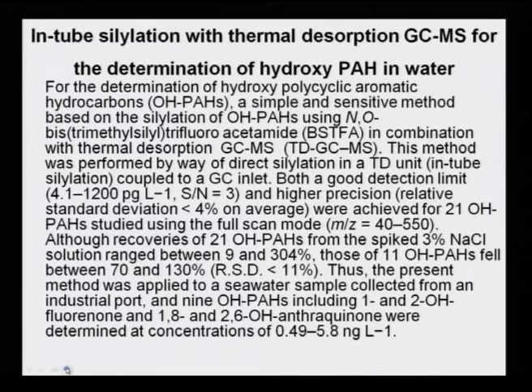Although recoveries of 21 hydroxy PAH from the spiked 3% sodium chloride solution ranged between 9 to 304%, those of 11 hydroxy PAH fell between 70 to 130%.